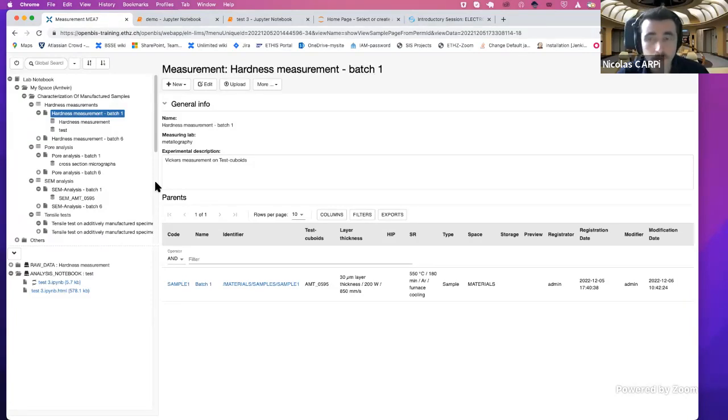Yeah. Okay, I will take this point. Thank you. And I also have another question. Do you plan to have an export in the ELN file format? I know we had a discussion with someone from openBIS a few weeks ago. Yes, I know you've been talking to my colleague Henry, I believe, on this. Yes, we need to look into this. I think that this is a very interesting idea also for us. So we will look into this.